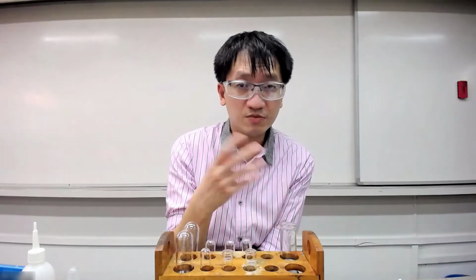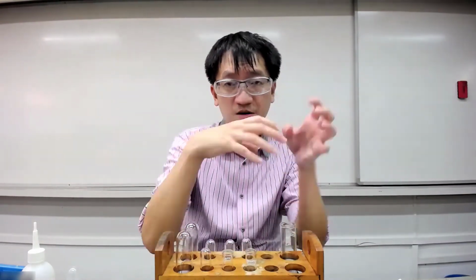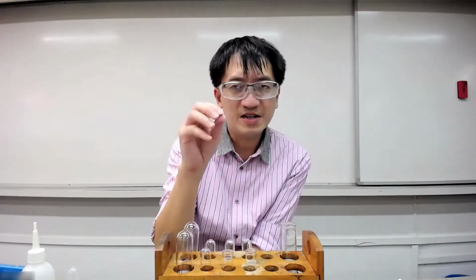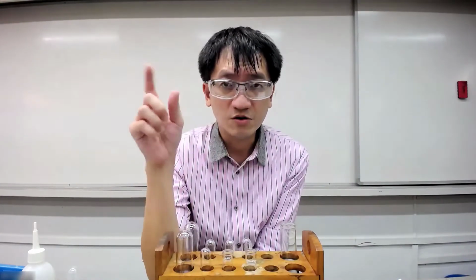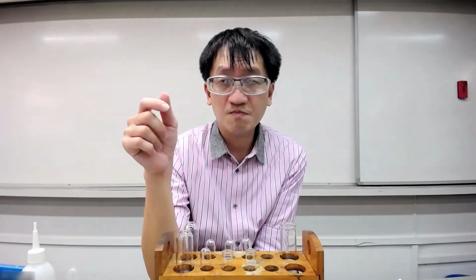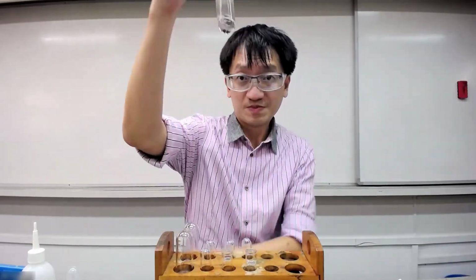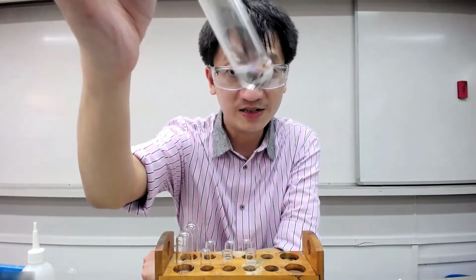dirty green PPT was produced, and then for the filtrate, from the major batch of solution, I asked you to observe, and then the observation is supposed to be turn colorless, but it appears a little bit cloudy. If you just rewind the video, you will notice that it's a little bit cloudy, right? So you might be wondering, how does it look like after you place it there for an hour or two? So this is how it looks like. Can you see that it completely turns colorless?